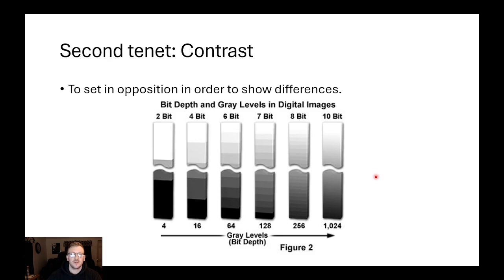The other way that we can do that is through manipulation of light, which is called phase contrast, which we're going to get into in a little bit here. One thing to remember is microscopes only see in black and white. There is no coloration of a microscope. Any microscope image that you see that is in color has been digitally modified to assign color to gray values. So you don't actually see in color with microscopes. They only ever see in black and white.